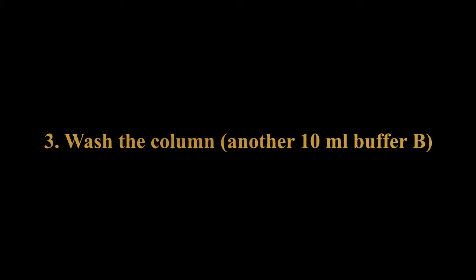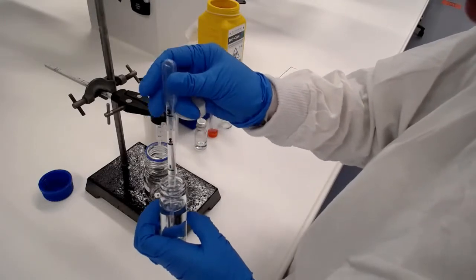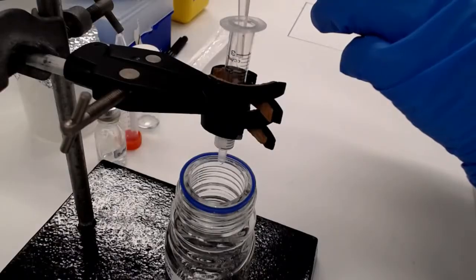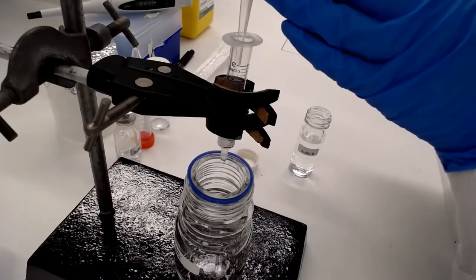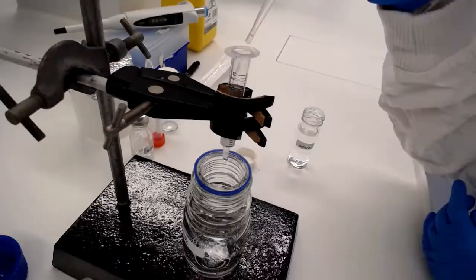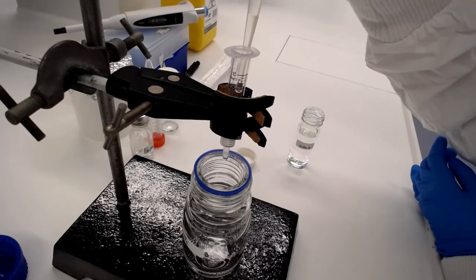Once we've added all our cell extract, it's now time to wash the column again with another ten mils of buffer B. I've just sped this up here. Another ten mils slowly added to the top, three, three, three, and one. What that's doing is pushing off all the E. coli proteins, which do not stick to the column in the presence of buffer B with the low imidazole concentration. Our PFU protein should still be stuck onto the column.